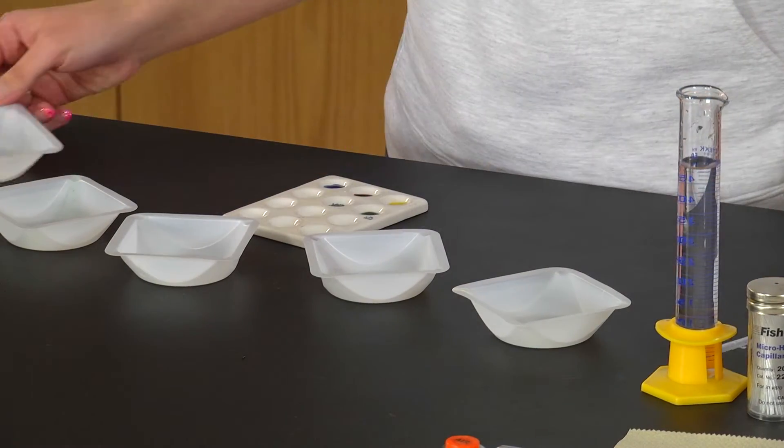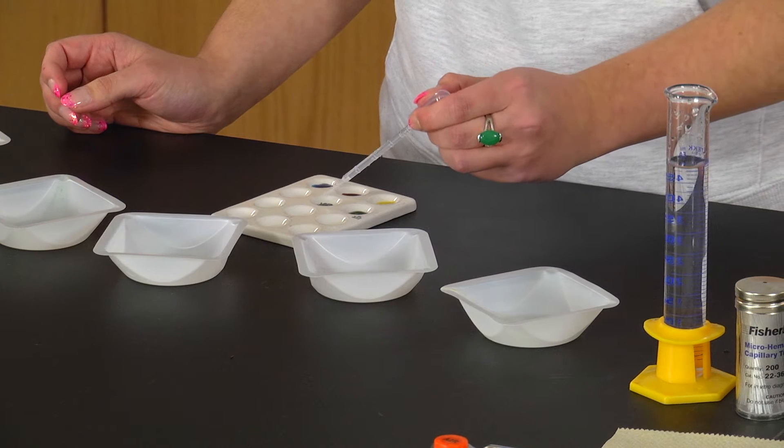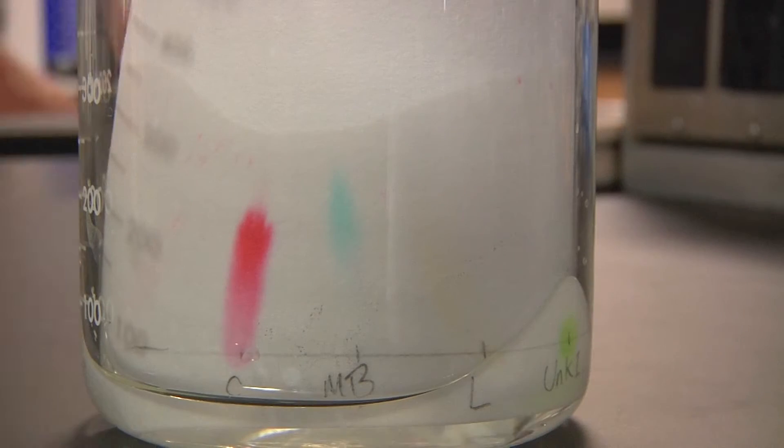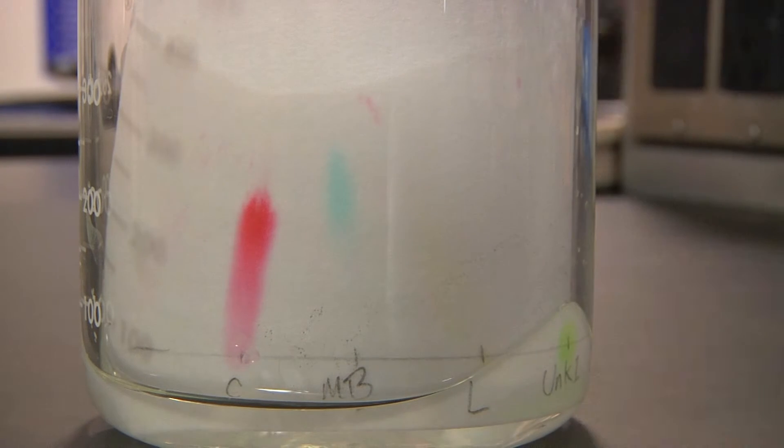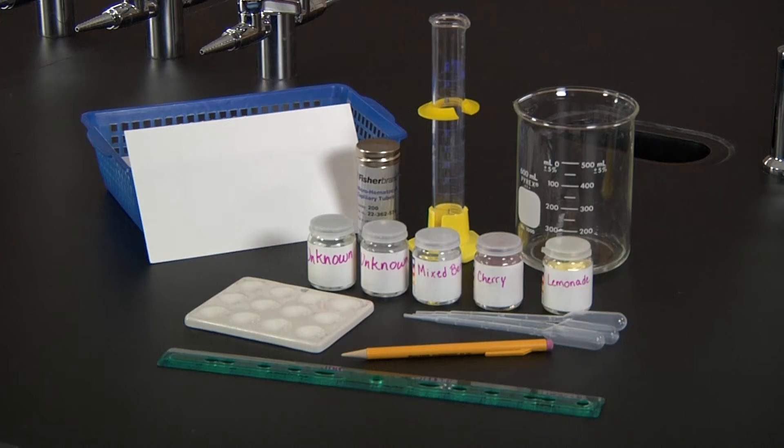The two main factors that allow this separation are the solubility in the mobile phase and how well the substance is absorbed in the stationary phase. In this experiment, we'll be separating the dyes found in various powdered drink mixes and then we'll be determining the dyes in an unknown drink mix.